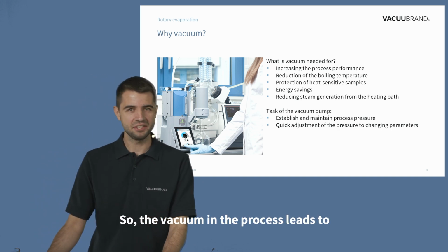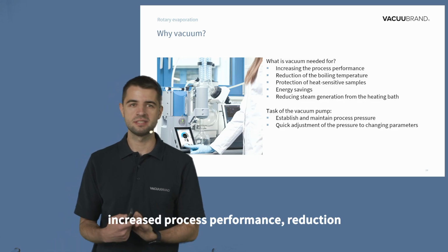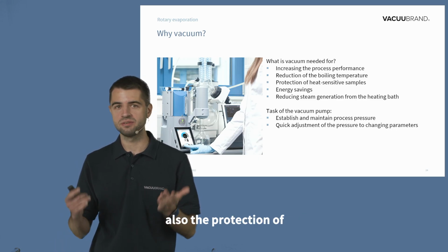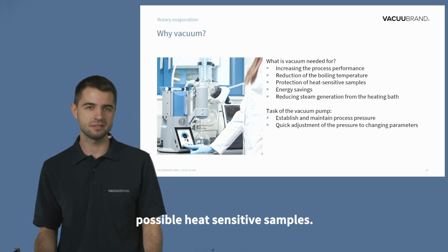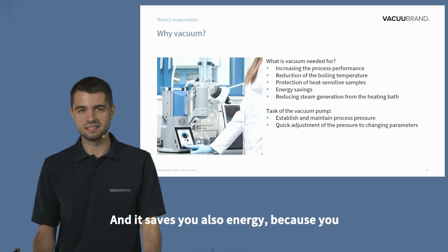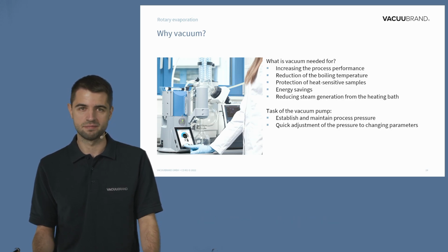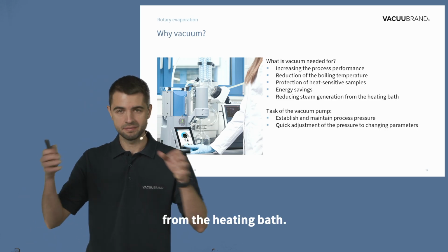So, the vacuum in the process leads to increased process performance, reduction of the boiling temperature, therefore also the protection of possible heat sensitive samples, and it also saves you energy because you don't need very strong heating anymore. And it is reducing the steam generation from the heating bath.